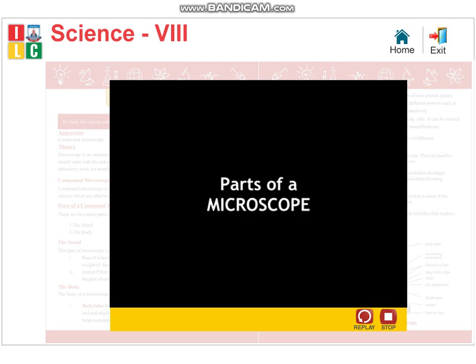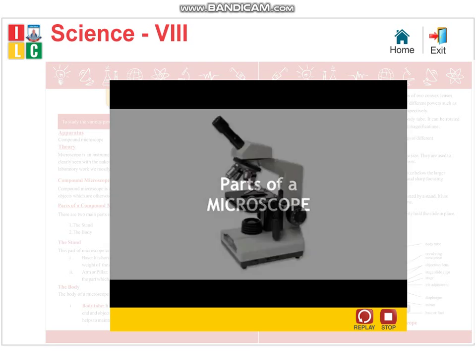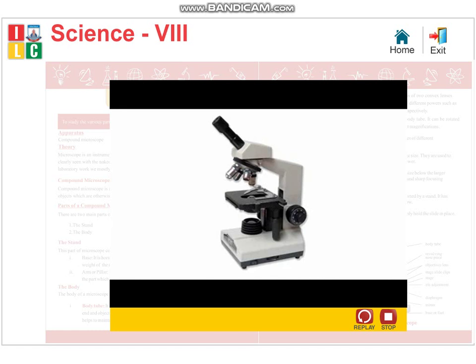This presentation outlines the main parts of a compound light microscope. It also briefly describes the functions of these parts. So, let's begin.